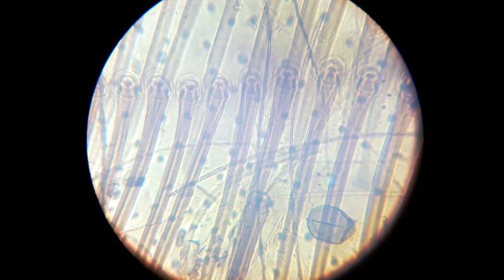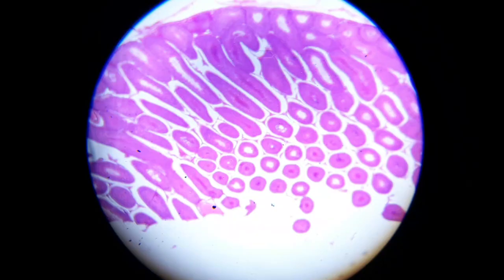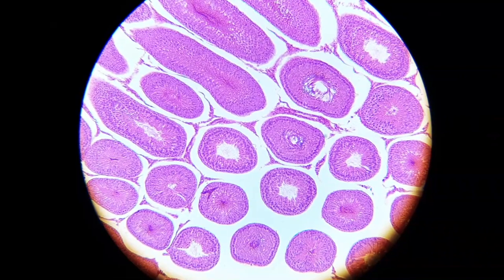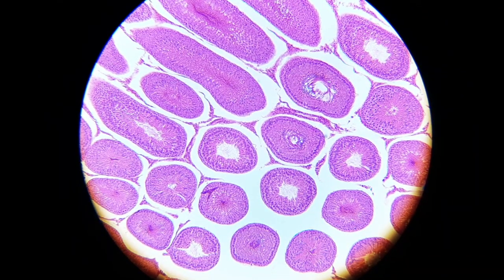I'm focusing back and forth. So there's a little bit of stray light here. That's why the colors look a little bit faded out. And here, that's a cross section of testes tissue, also with 4x magnification, 10x magnification. And I'm actually using the same specimen slide in school when I'm covering the topic.